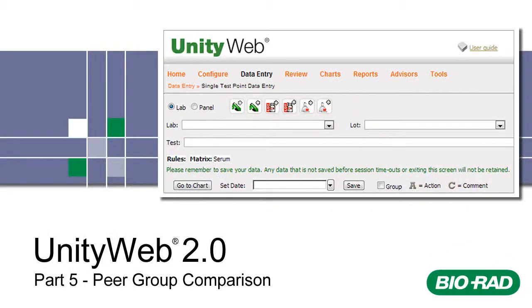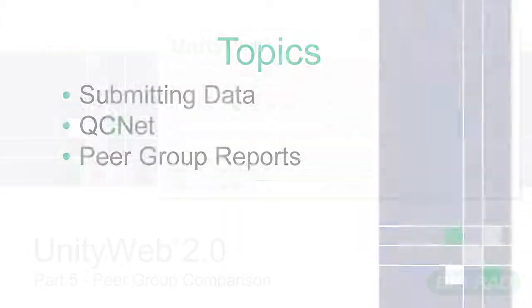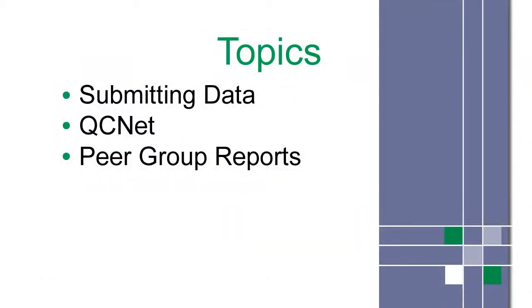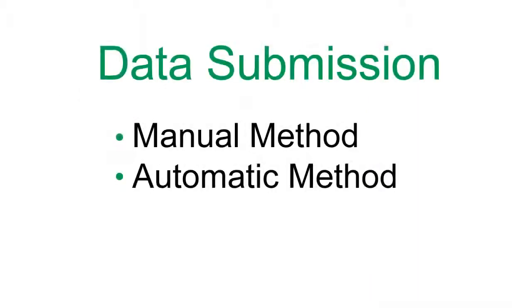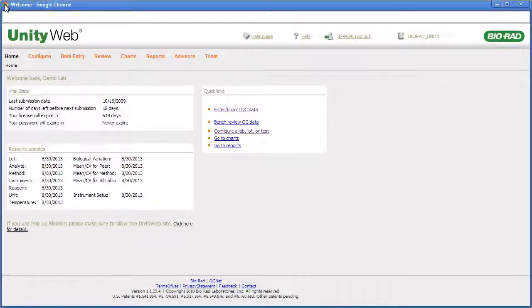Welcome to Unity Web 2.0 Training Part 5. This is a list of topics covered in this video. There are two ways to submit your data at the end of each month: the manual method and the automatic method.